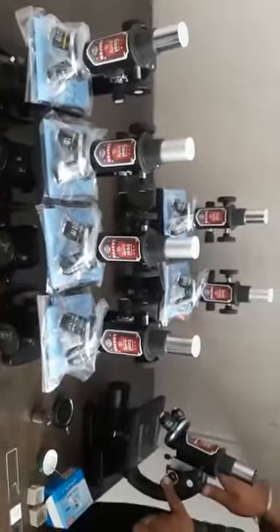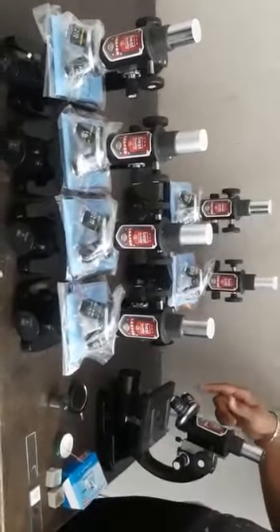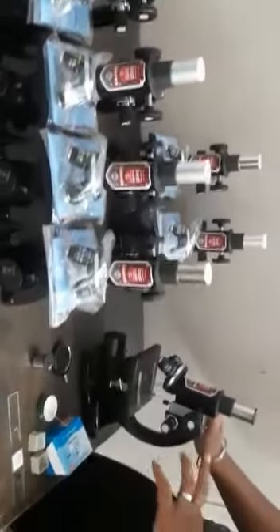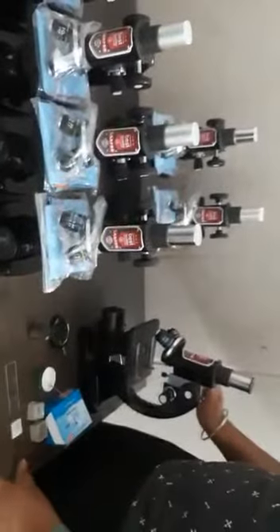Hello, this is our Labprose compound microscope with LED lamp. This is ready stock of our compound microscope, and I will tell you how to operate this microscope to see the proper results.